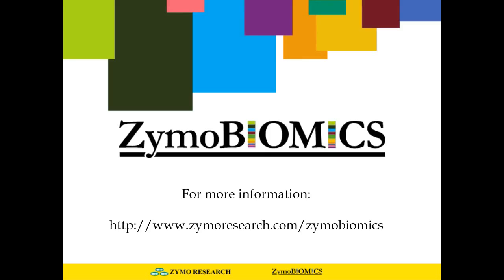How do chimeric sequences form during 16S library preparation? For this question, there are several publications investigating PCR chimera formation in 16S library preparation. PCR chimera is a problem in PCR reactions in which there are a variety of different but also highly similar templates coexisting. One potential mechanism of how they form is that in a step of PCR elongation, early elongation termination results in partially amplified sequences in one cycle, and these partially amplified sequences are used in subsequent cycles as primers for further elongation. When they anneal to a different template, a hybrid product from two different templates is produced.